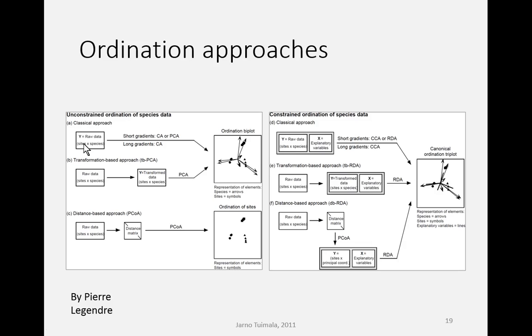They could be individual persons, plots in the forest, or whatever. And this is similar to, let's say, regression analysis, where you have some kind of explanatory variables that you can take into account in the analysis, whereas this PCA doesn't take these explanatory variables into account at all.